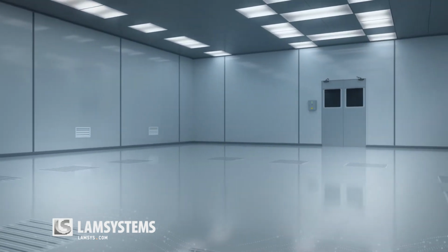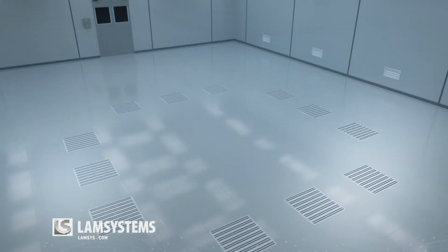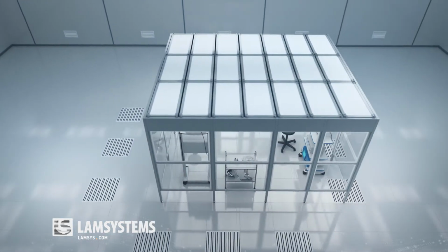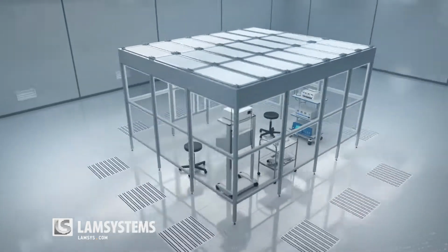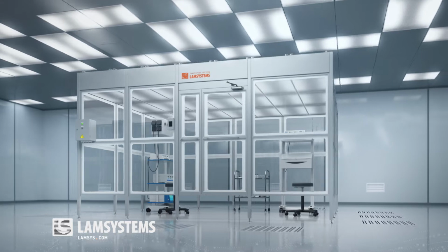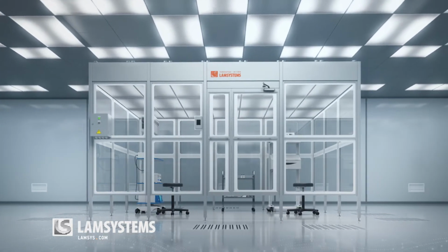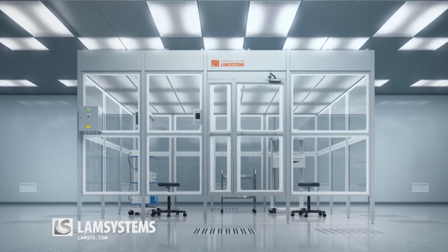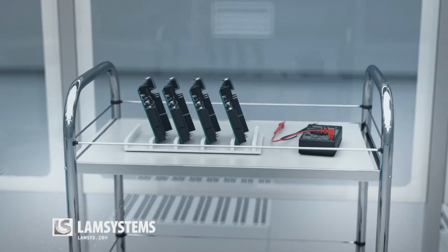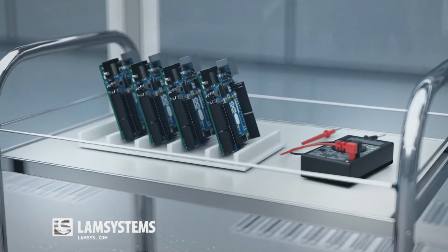One of the efficient ways to decrease costs during clean room development is zoning of the facility into local areas called clean zones. A clean zone is a local enclosure designed as a room inside a room. The main purpose of the clean zones is protection of a product from external contamination and maintenance of preset air cleanliness parameters in a local work area.